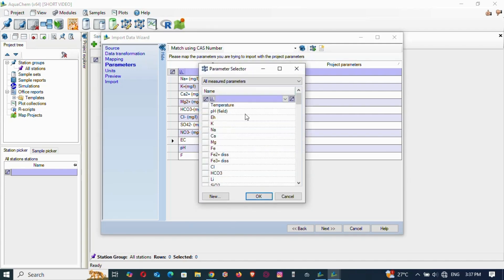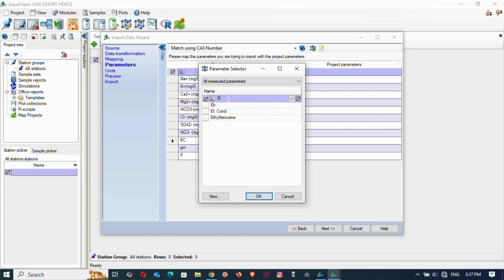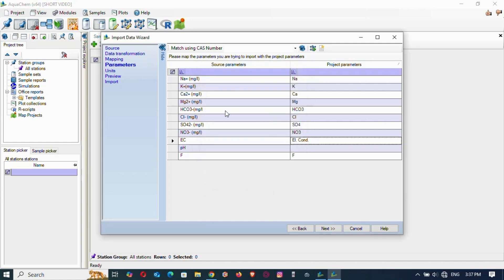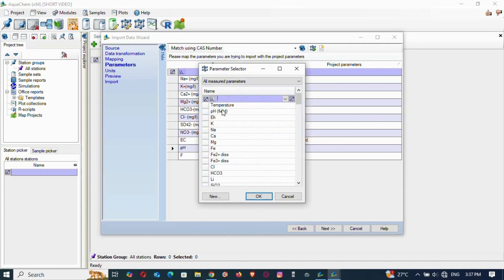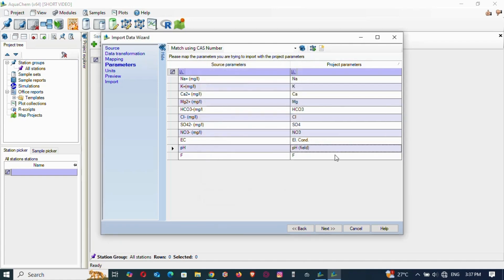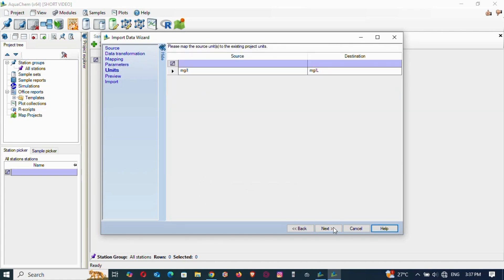For EC — electrical conductivity — just type 'E' and it will come; select electrical conductivity. For pH, just pick the pH field as measured in the field. F (fluoride) is already selected automatically. Then proceed to Next.